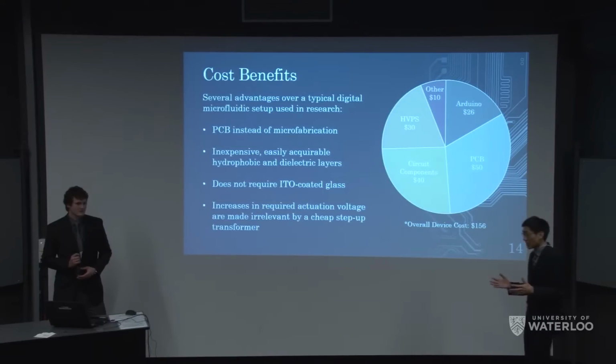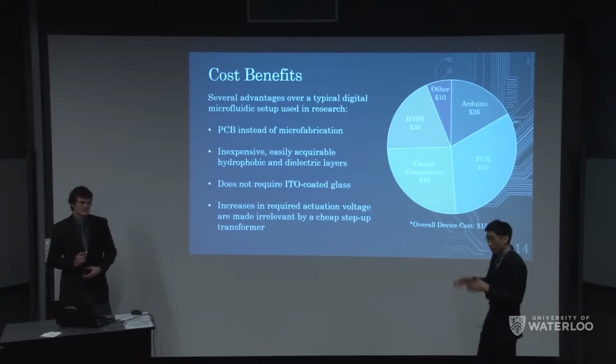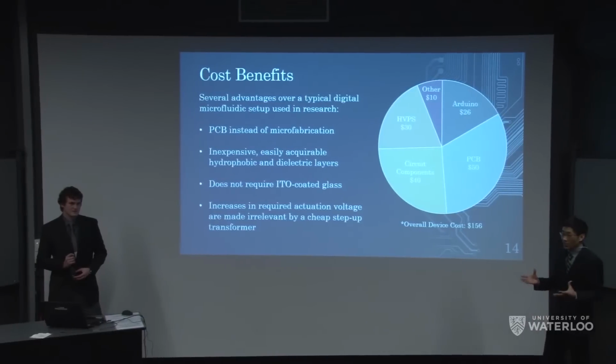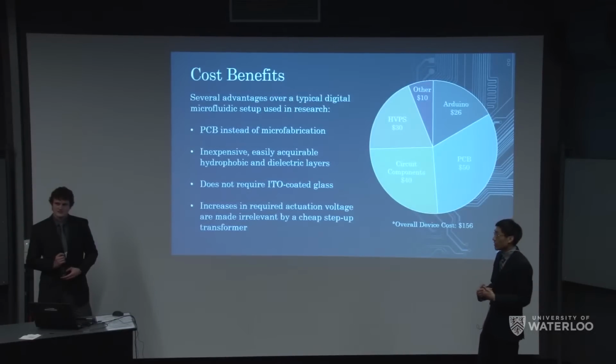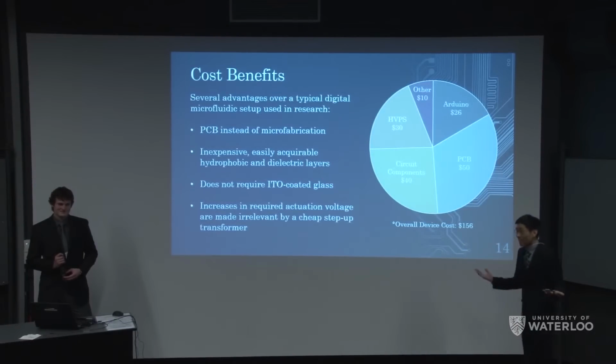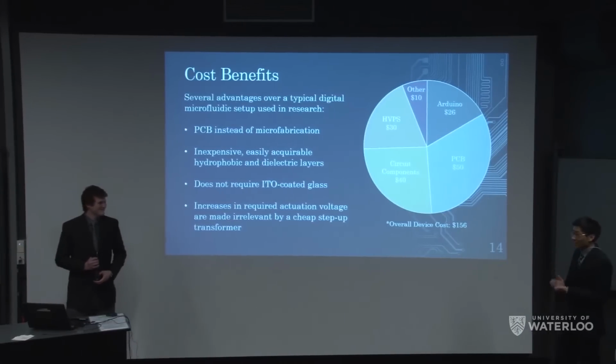So what we're essentially asking here is, we can create a virtual package that could potentially be set up on an open source platform. It's something that could be accessible to everybody. So if you're a microfluidic enthusiast, this is something for you.